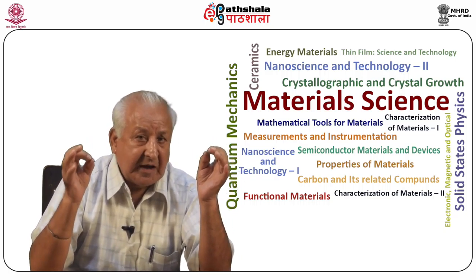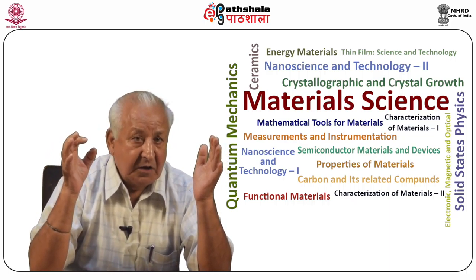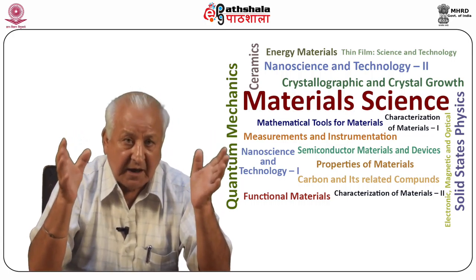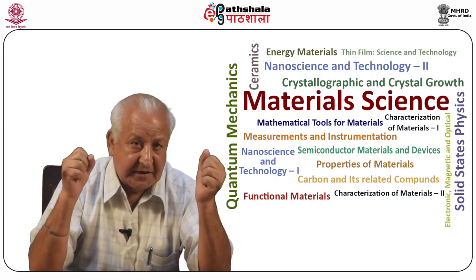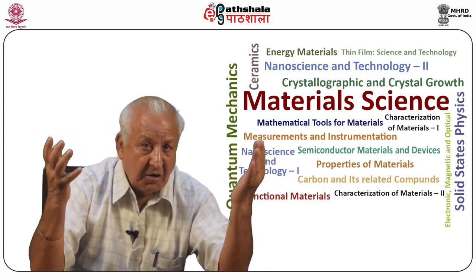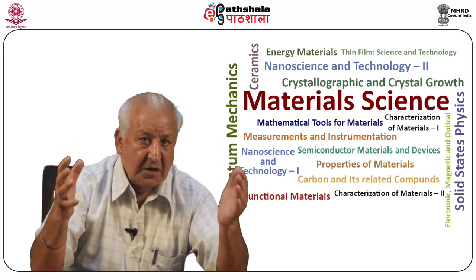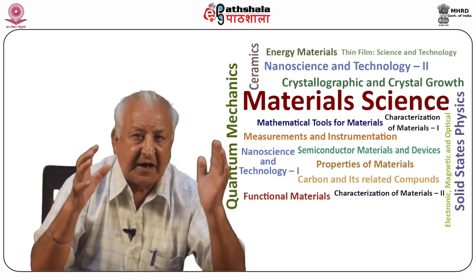One of the most useful capabilities of the electron microscope is that it forms electron diffraction patterns from very small regions of a sample, which may be typically about 1 micron in diameter. Combination of the results of electron diffraction from a substance and morphological evidence from electron micrographs of the same region provides invaluable information in relating, for example, growth habits to crystal structure features and in studying epitaxial relationships between crystalline phases.